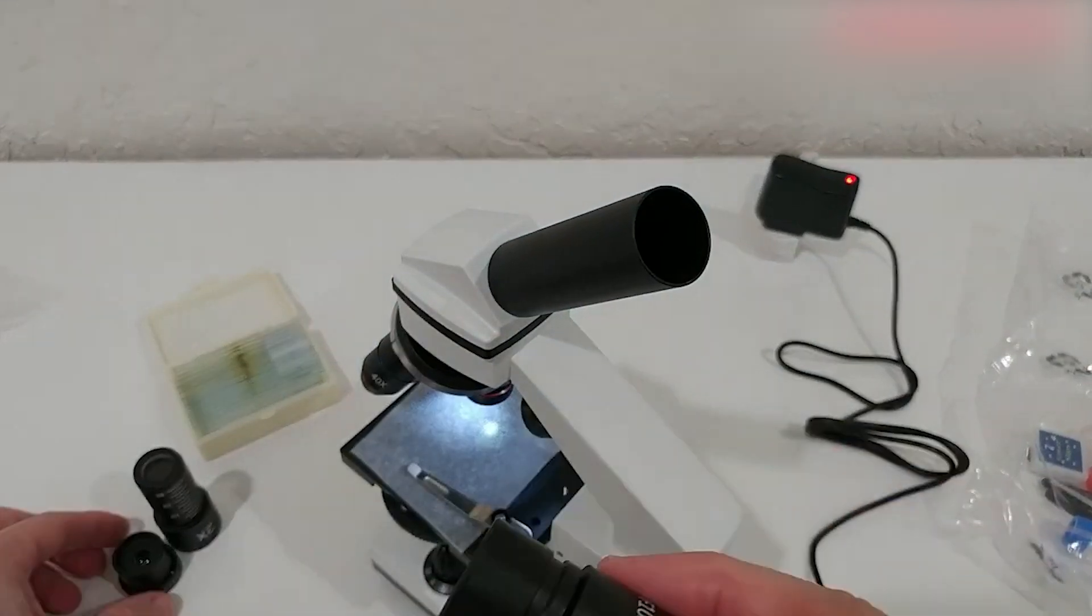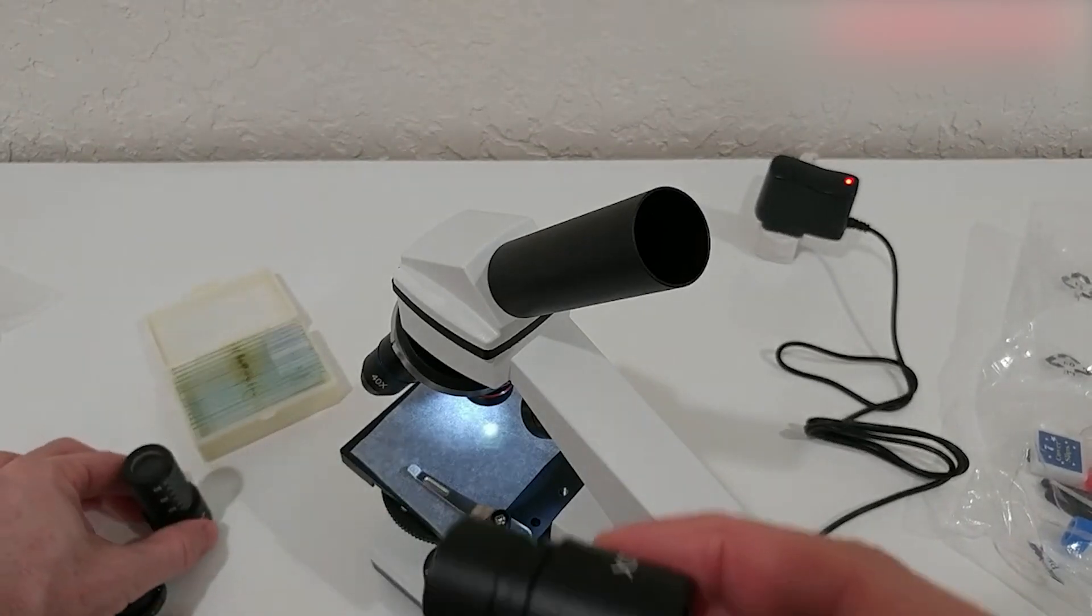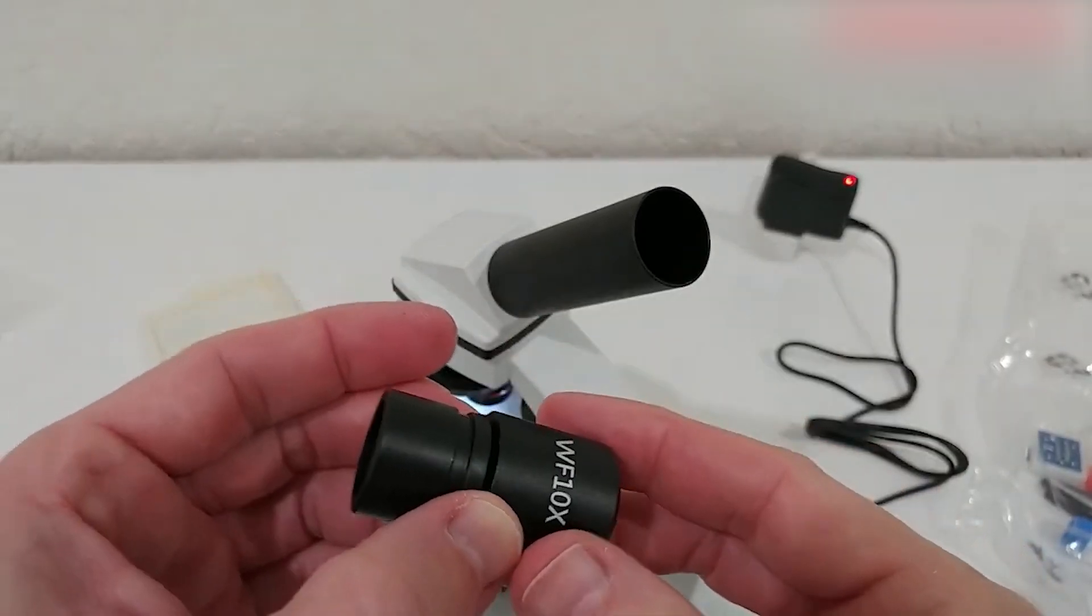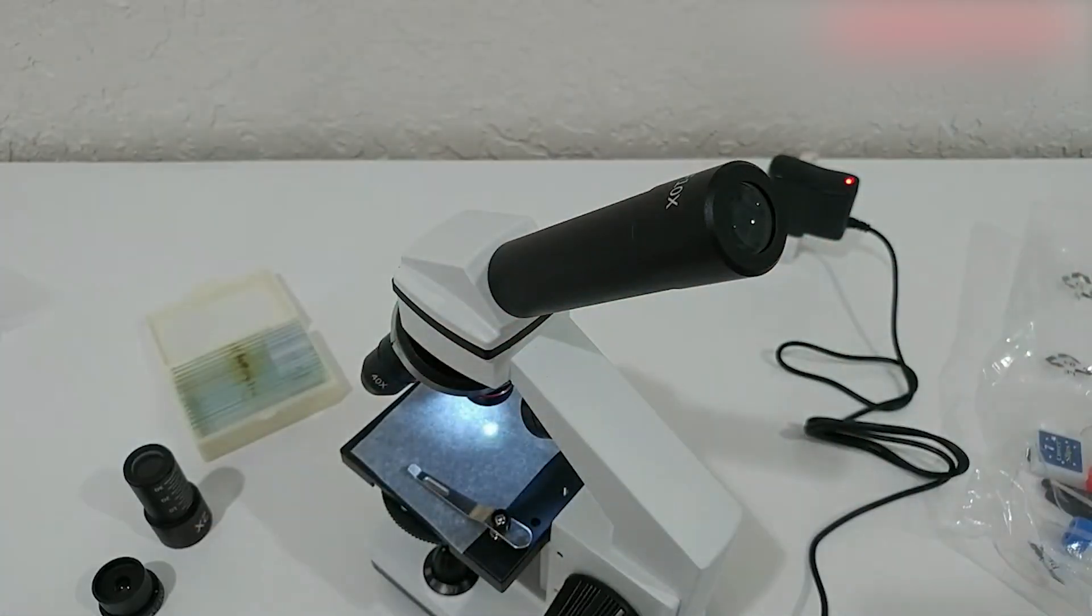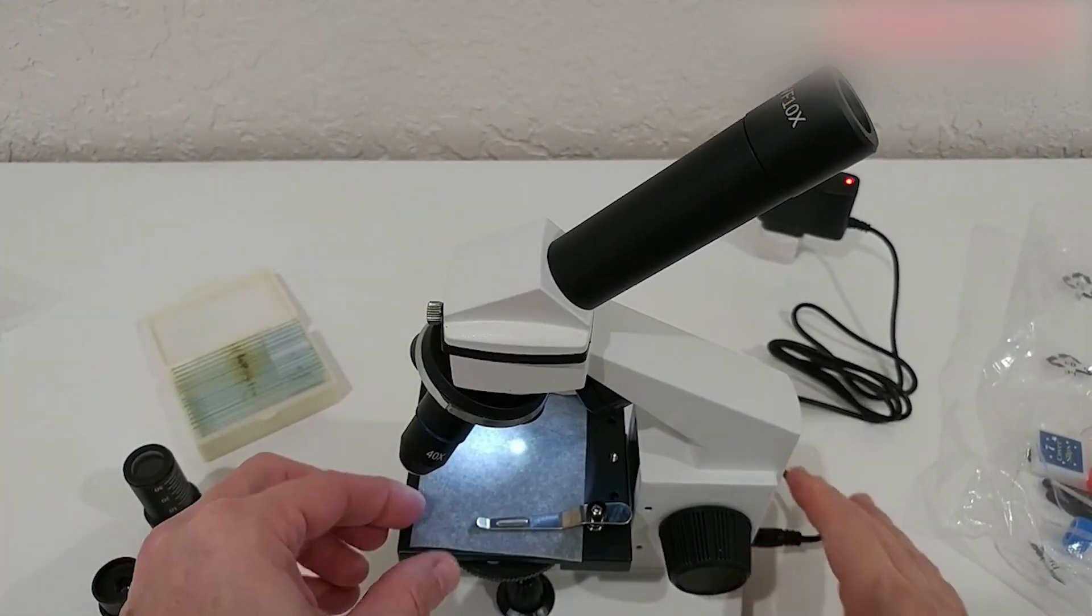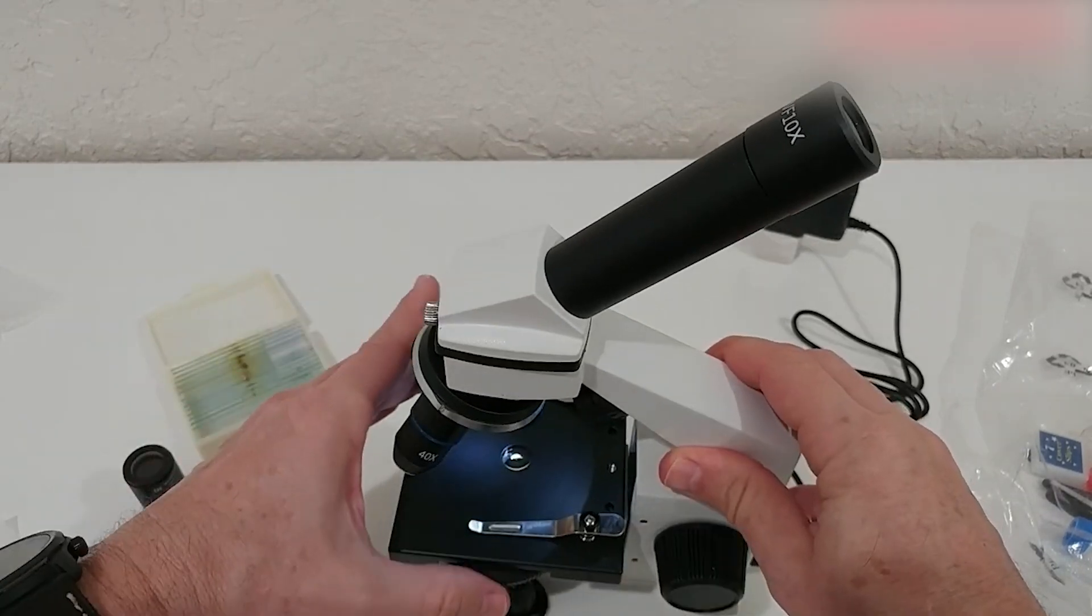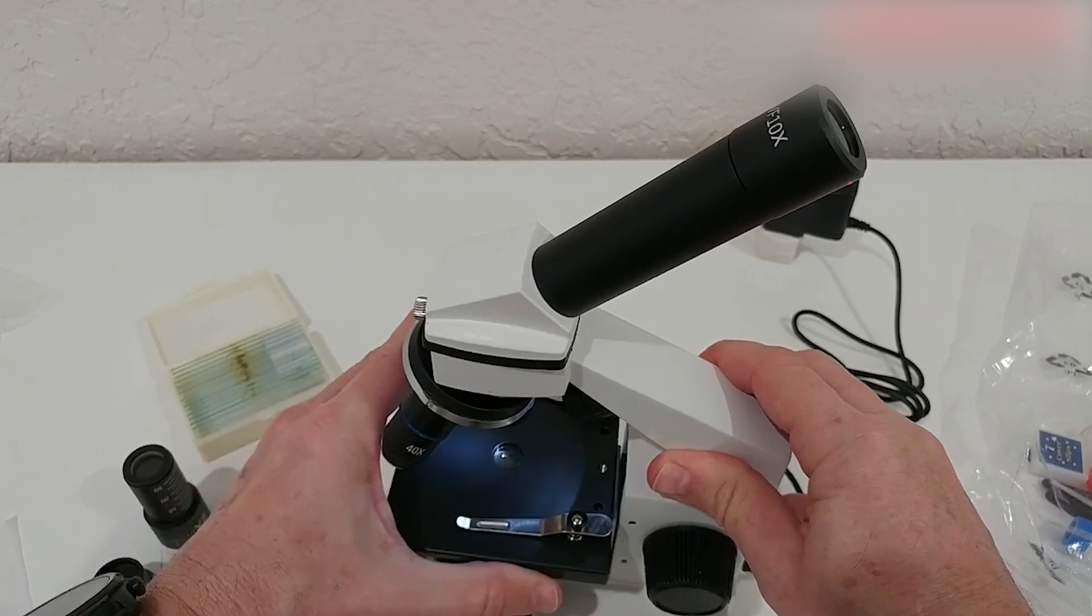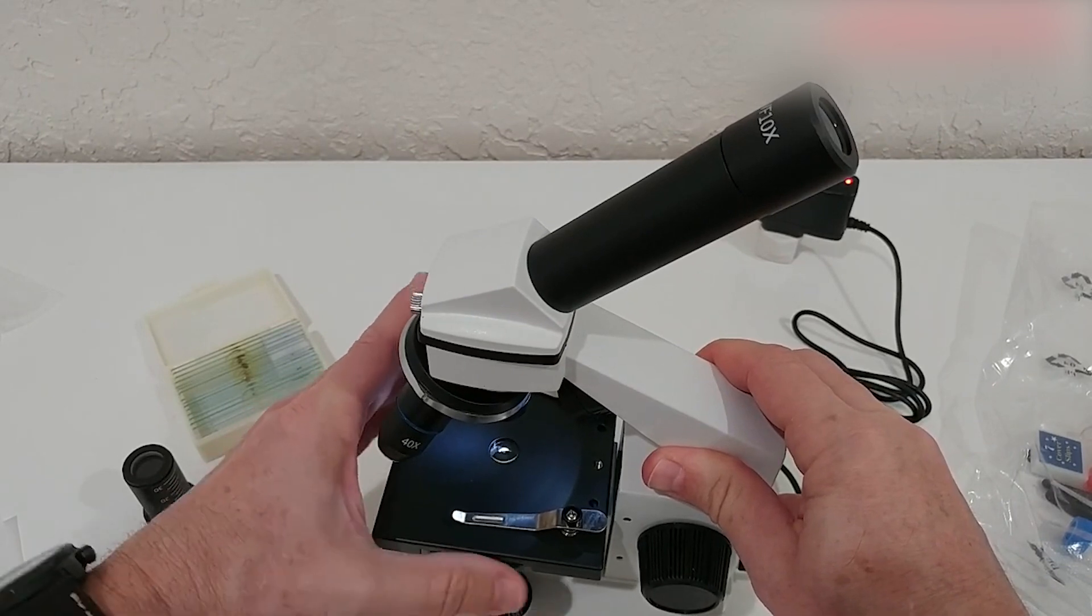This 100x to 2000x biological microscope is not just a tool, it's a practical educational resource designed for everyone. Whether you're a student eager to learn, a parent guiding your child's curiosity, an adult exploring a new hobby, or an amateur scientist conducting experiments, this microscope is perfect for you. It's particularly well-suited for school labs, home learning environments, or one-on-one instruction, making it an excellent choice for teachers and parents alike.